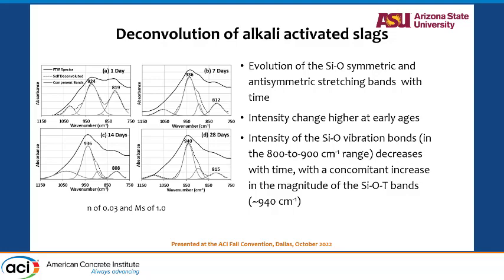And you can actually now look at SiO symmetric and antisymmetric stretching bands, which are together in the actual Fourier transform spectra. Once you start differentiating it, you will know which one is increasing in magnitude, which tells you, is aluminum being incorporated into the SiO structure or not? Once the reactions are done, are you still getting a quartz structure, with some connections giving you the strength, or is aluminum really replacing silica in the tetrahedral structure? Right? You can do that.